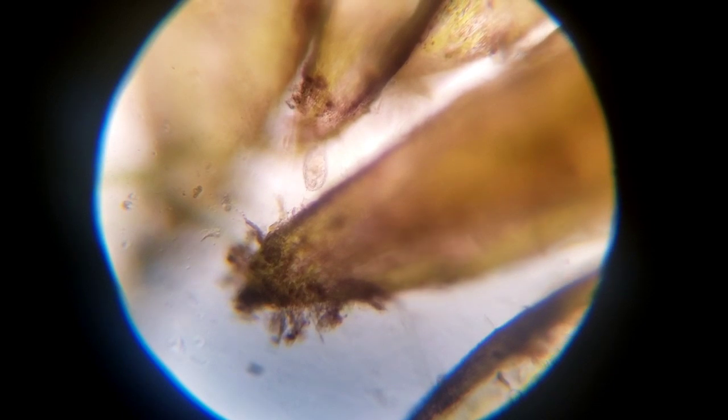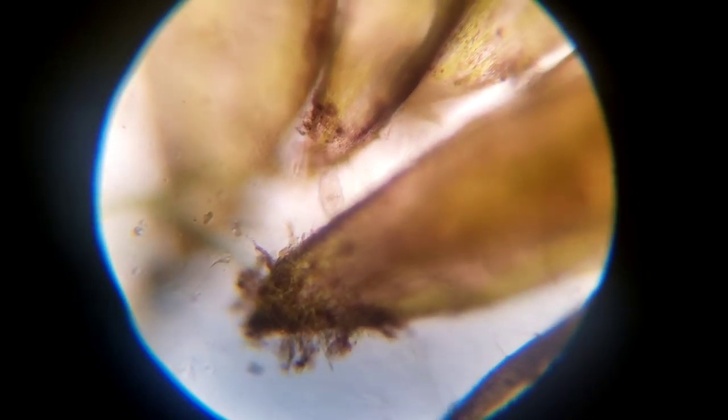As we continue along, you're going to see more plant matter. This is more moss. Here you can see we've got some other little single-cell organism here. Usually you can make out a nucleus and organelles. If we had some dye we'd probably be able to tell a little bit more, but this looks like another pitcher plant type layout where it has a foot that is attached to the surface. Then it has a little mouth at the end of its oval shape that it can open, and it has these little hairs that will trigger it to go off. It also has two little light-sensing eyes. So it's slightly different than the other one, but somewhat similar.